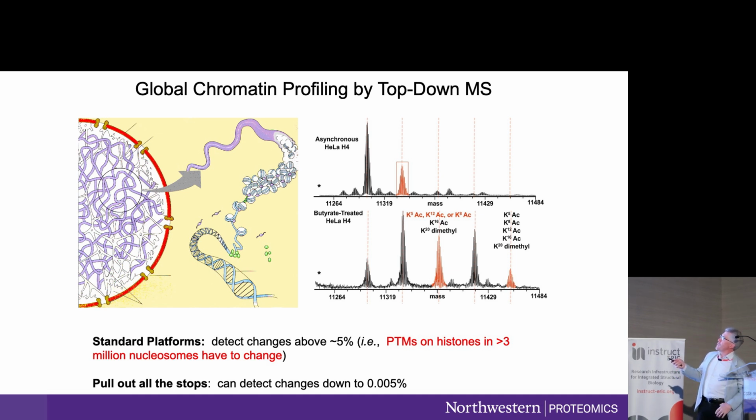We've done many papers on this, like the progressive mono, this is 14 Dalton increments. So the progressive monomethylations that occur on K20 throughout the cell cycle, that's been mapped out. This one now has an internal acetylation, plus 42 Daltons, and 60% of it is K16 acetyl, and 40% is K12 acetyl. And so those are actually two proteoforms under that mass peak. So this is all like 50 papers worth of studies, and of course if you inhibit deacetylases, you get a very different pattern. You get a hyperacetylated state here.